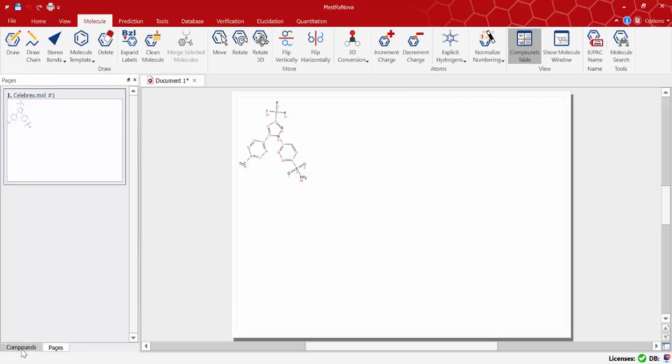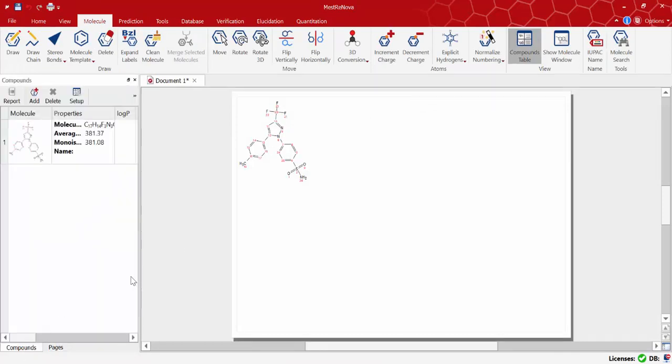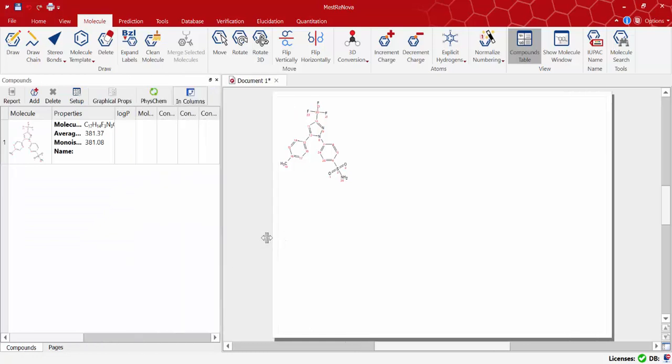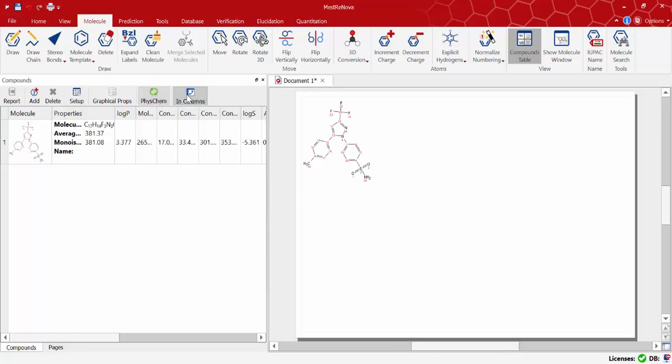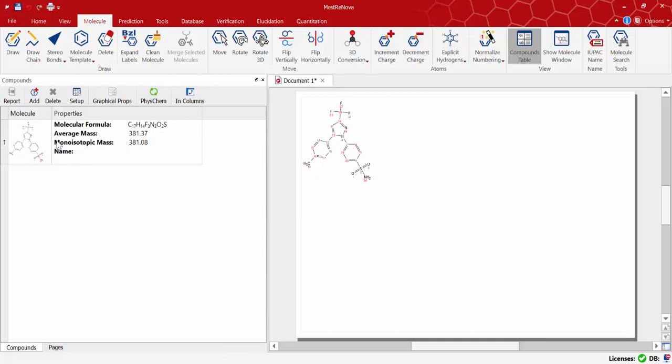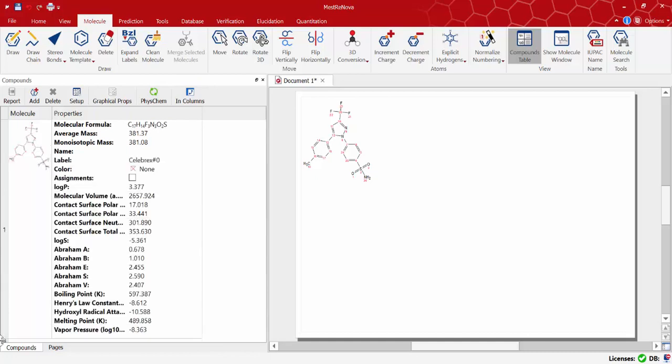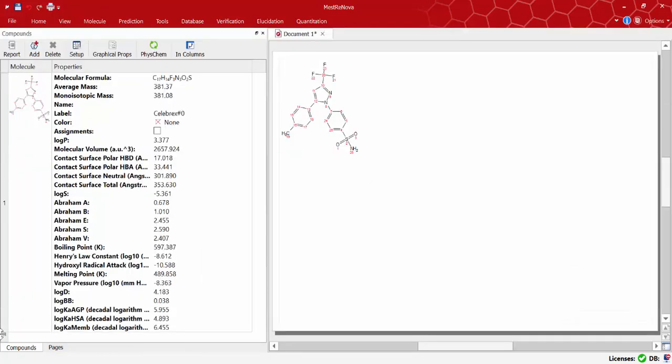Just to show briefly that having this separate license we can open a new document, load a molecule. I'm using the Celebrex molecule again. Click on the PhysChem properties and report the properties as we saw before. This time we can see values for these special properties.